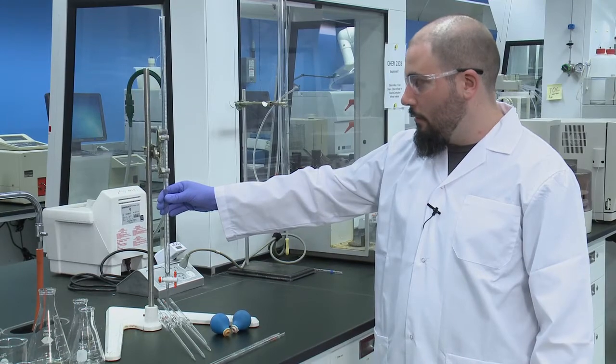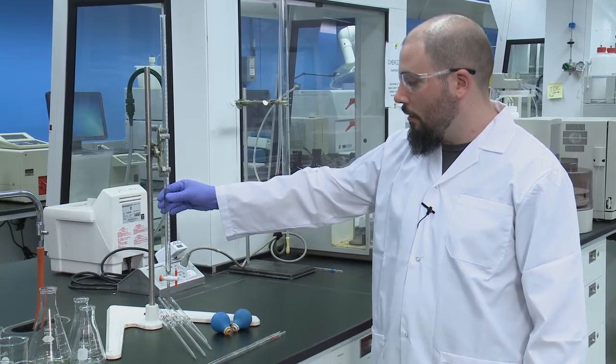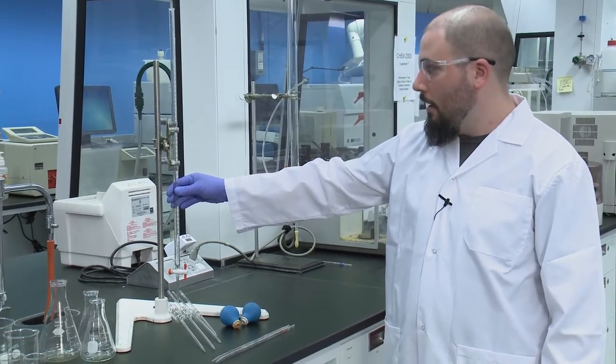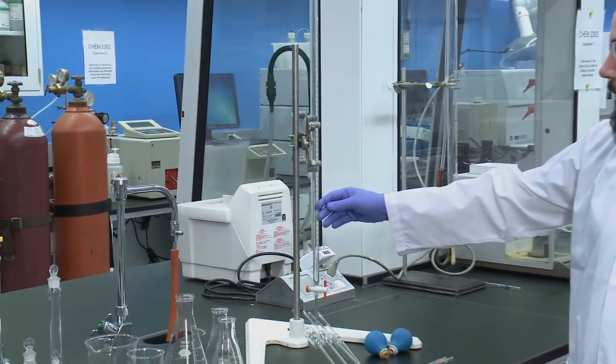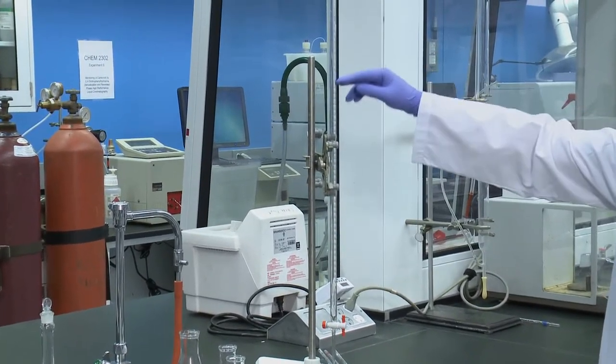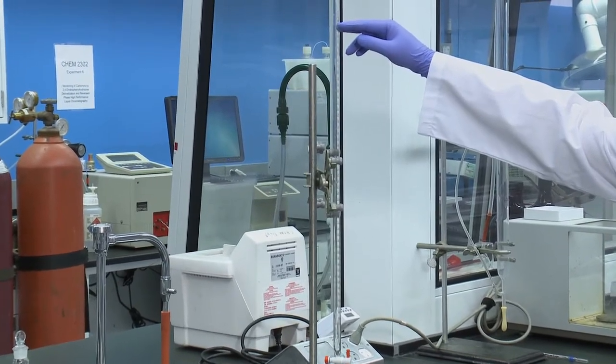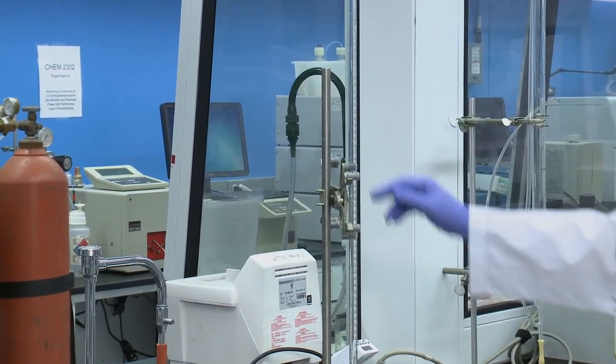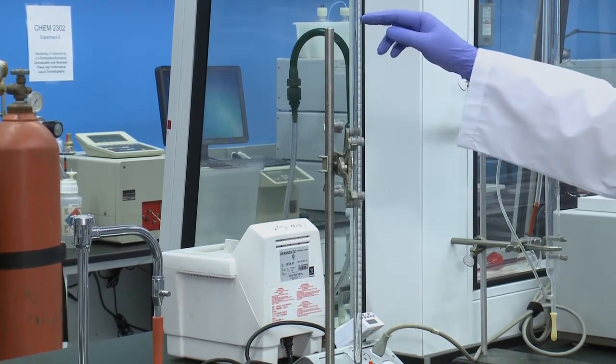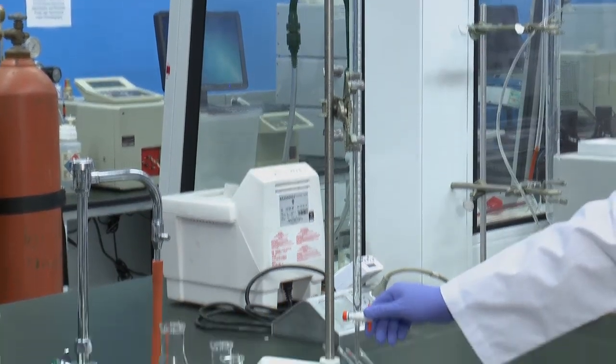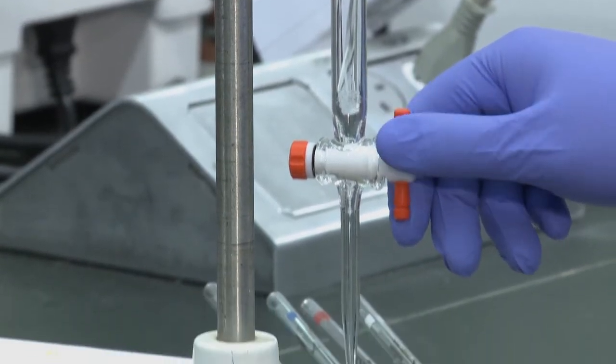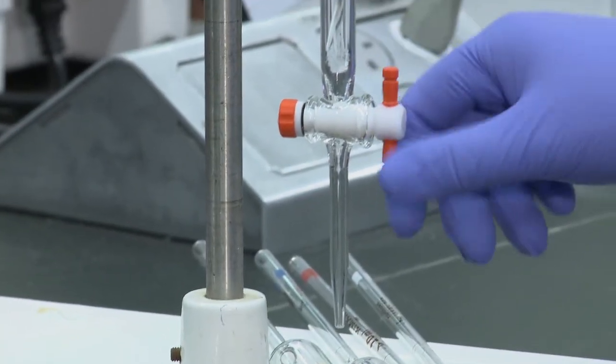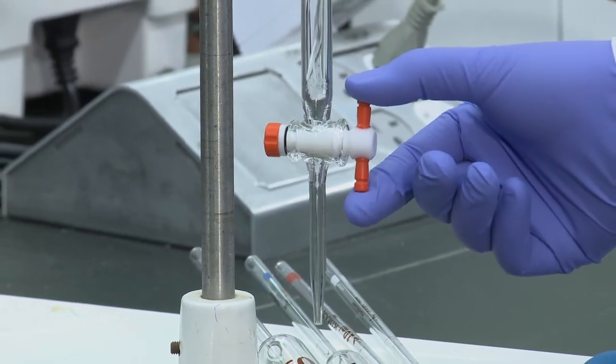On this stand we have a burette which is commonly used for titrations and is a good way of adding accurate volumes. You always begin at any of these lines and the volume you put into your flask is the difference between where you begin and where you end. Each burette comes with a Teflon cock stop located at the bottom which is used to control flow rate by how far you turn this piece here.